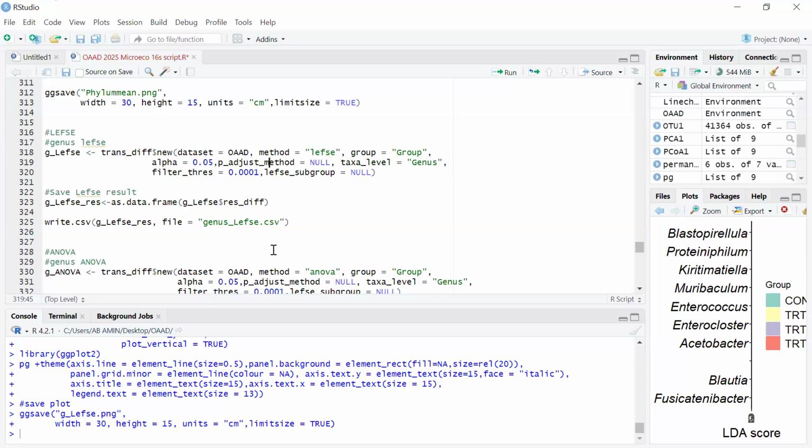Sometimes it will take me a day or 2, though there are softwares and packages that I have used. I have used about 7 or 8 packages for microbiome analysis, but this one is so far the most user-friendly I have seen. There are several packages that can take care of that. It will help you relate it to the closest relative. Okay, like which package, so that if I have that kind of data, I can use it?